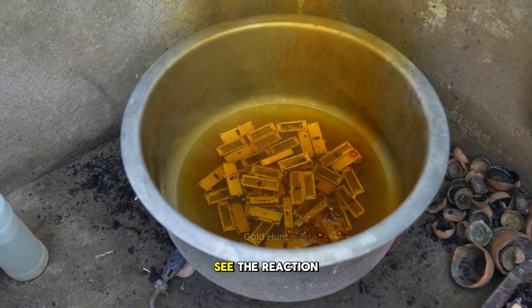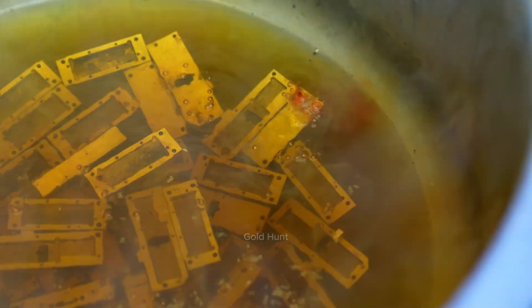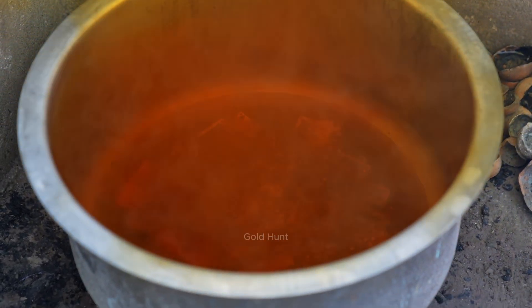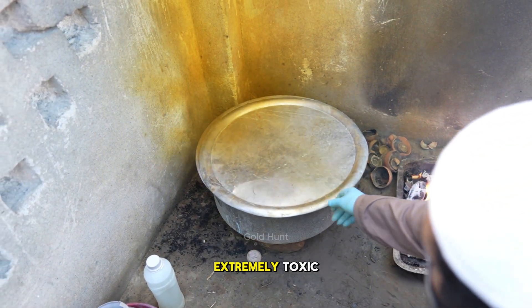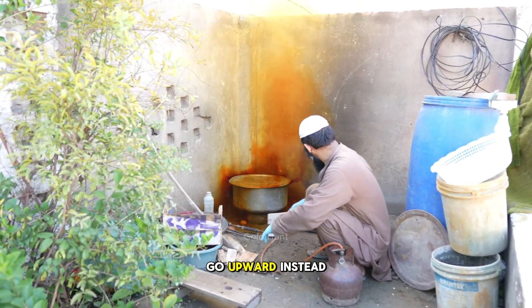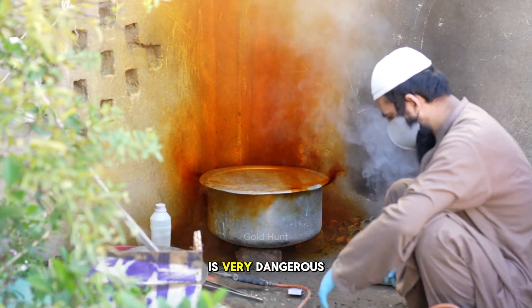As you can see, the reaction has started. The acid is boiling and the fumes are rising. Be careful though — this smoke is extremely toxic. Always keep some fire nearby so the fumes go upward instead of spreading around. And make sure you're wearing a mask and gloves because this gas is very dangerous.